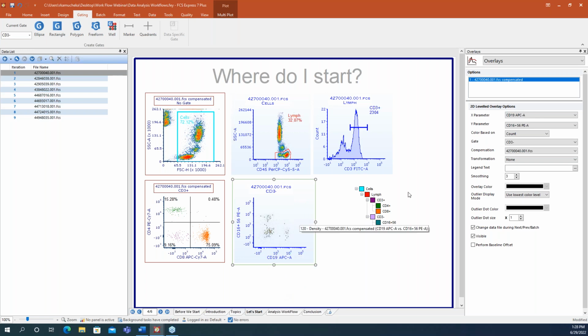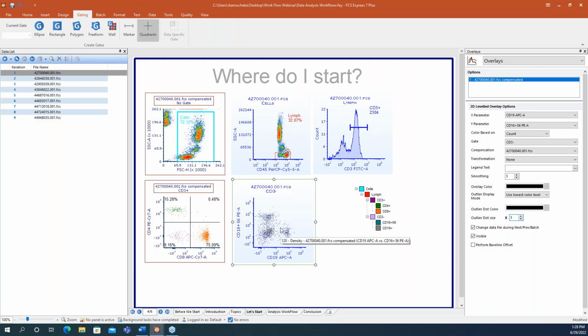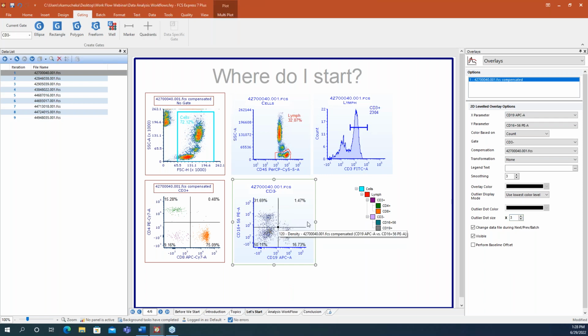As we're creating this, as we're moving through the workspace, we've gotten quite a few different plots here. So now I'm going to take a moment: we've got some initial plots created. What can we do next, right? With this, we've also got some gates already created for the CD16 and the CD19. So I'm just going to keep moving forward.